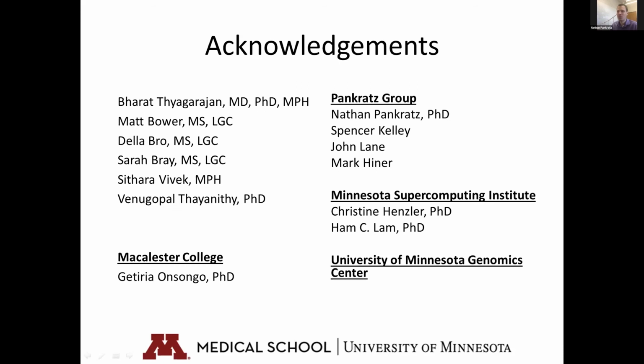We have a question from a member of the audience asking about MANTA and SVABA as another way to look at these. I've certainly looked at a lot in our research, and SVABA has had the best mix of sensitivity and specificity. It's a newer algorithm. Kelsey, Bharat, any talk about other methods that you are considering?